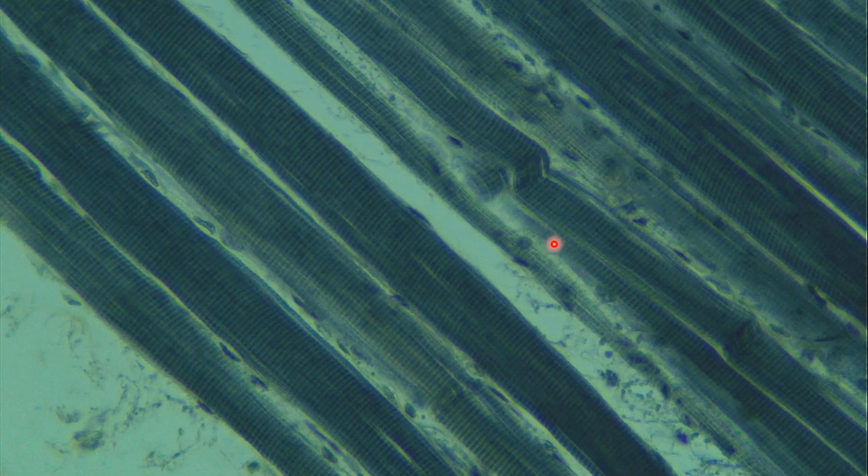This is another image of skeletal muscle. How do you know? Again, you have these long bands that are parallel and next to each other. You have the striations, so the little lines going back and forth, or little stripes, as I like to think of it. And you have multiple nuclei per cell, and they're located on the sides. There's not a nucleus just dead smack in the middle of the cell. You're not going to see that with skeletal muscle.